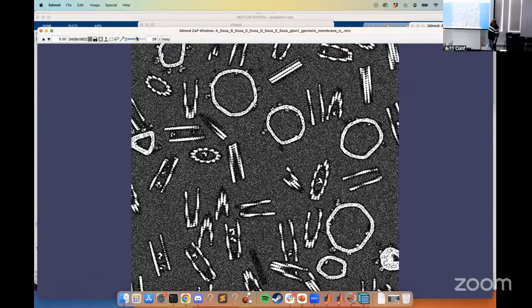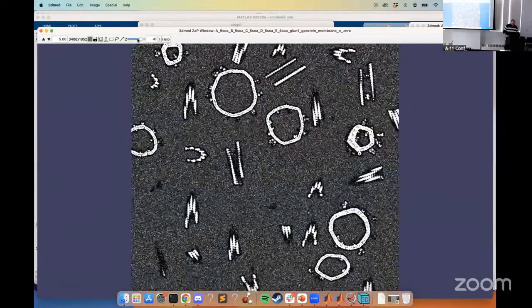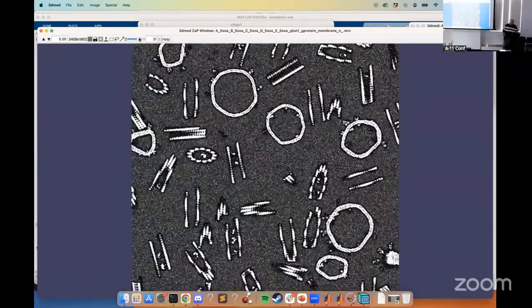It works, it's not exactly great. You have to define where the centroid of the transmembrane domain is. It doesn't know how to place it unless you tell it where the membrane domain is, and then based on the orientation it's saved in, it'll go in one direction or the other.